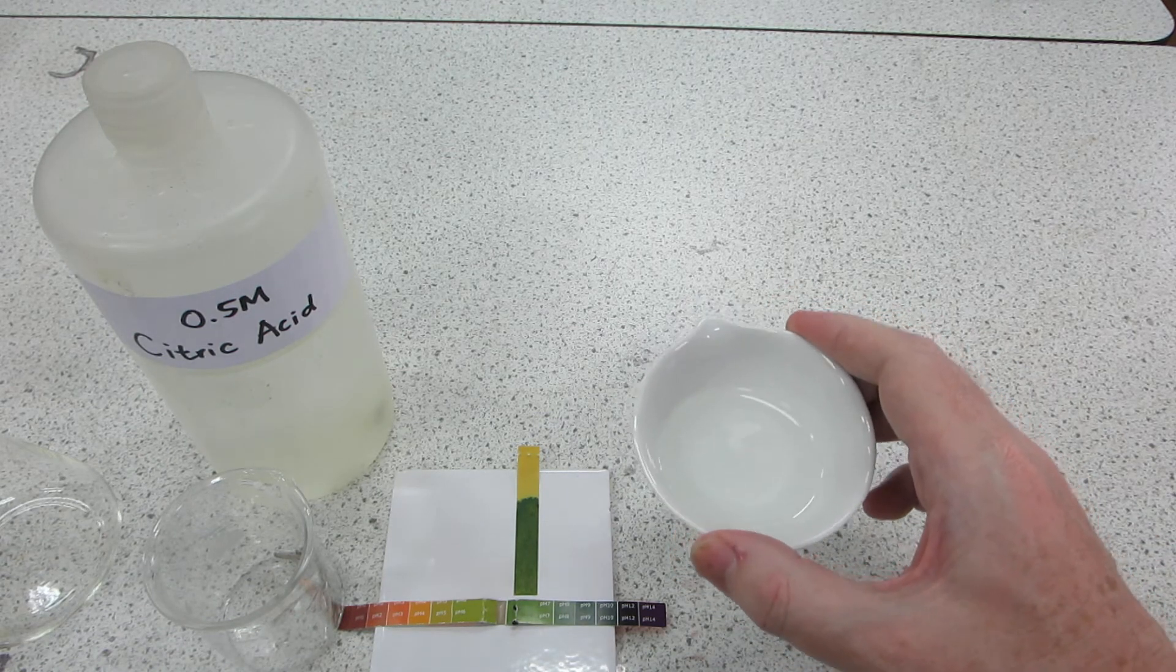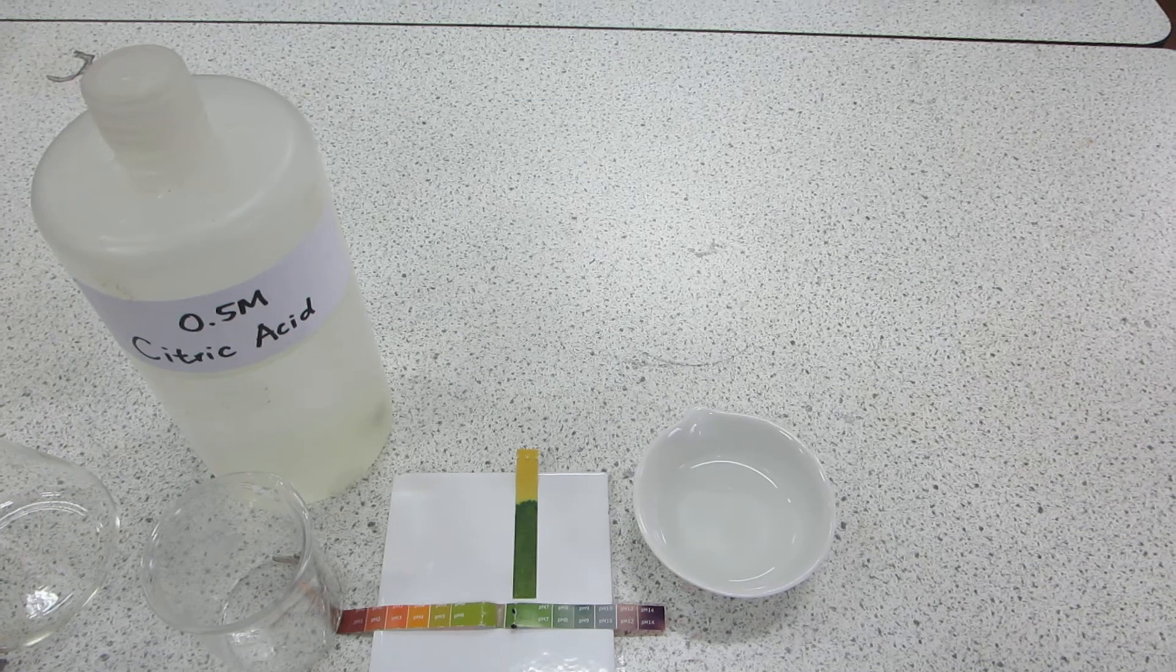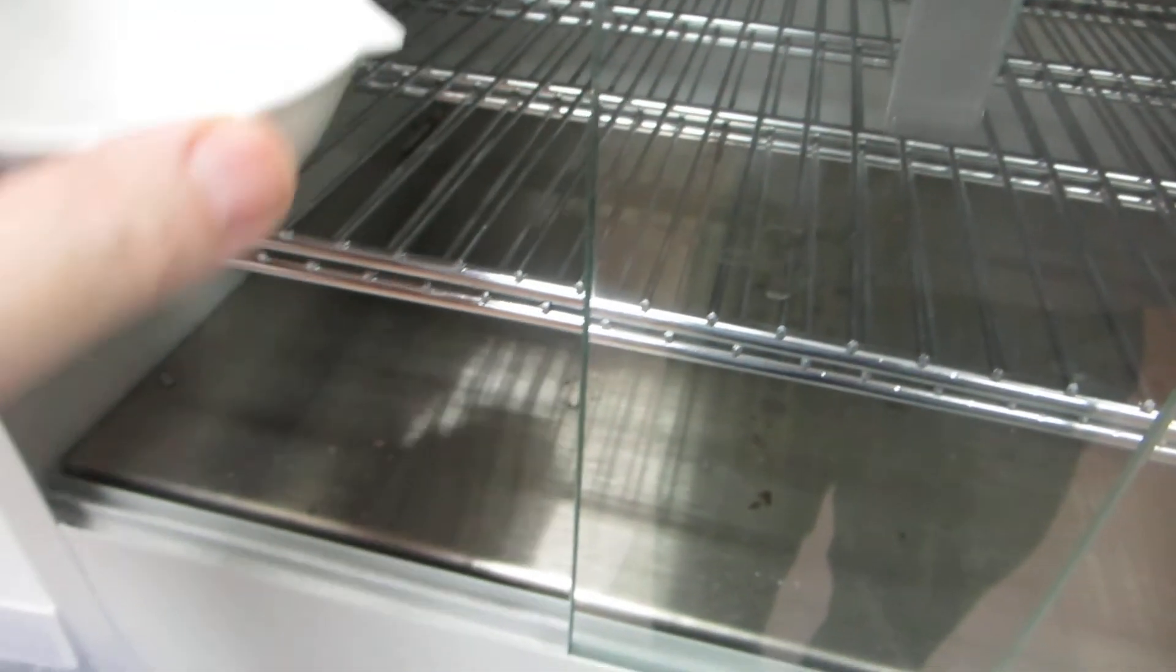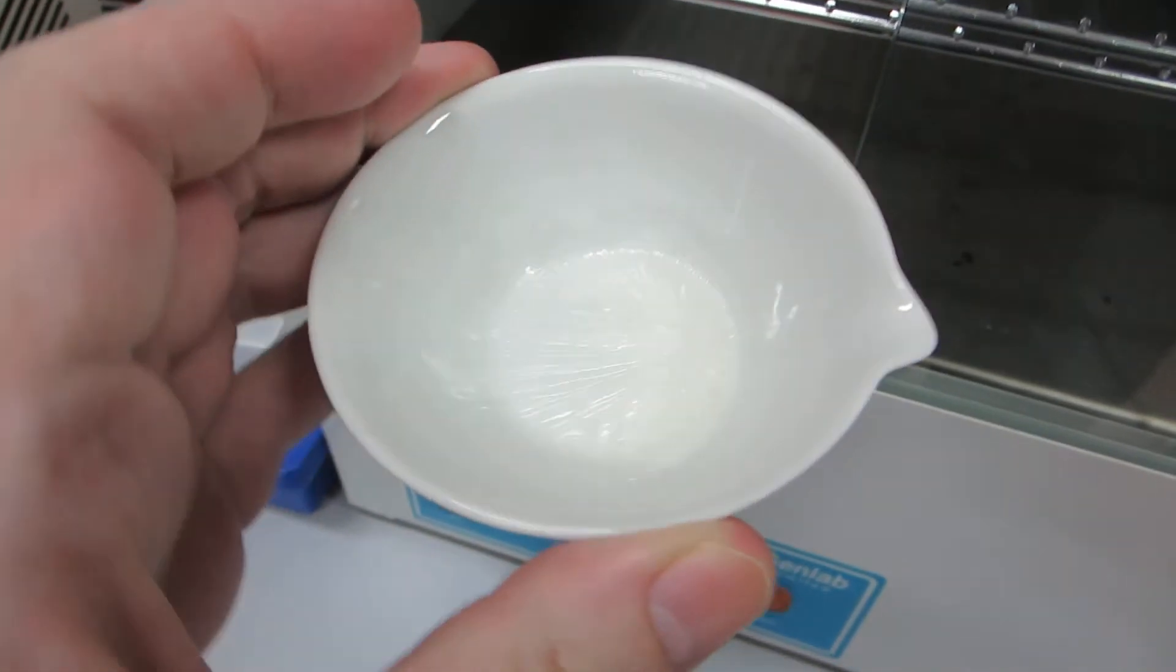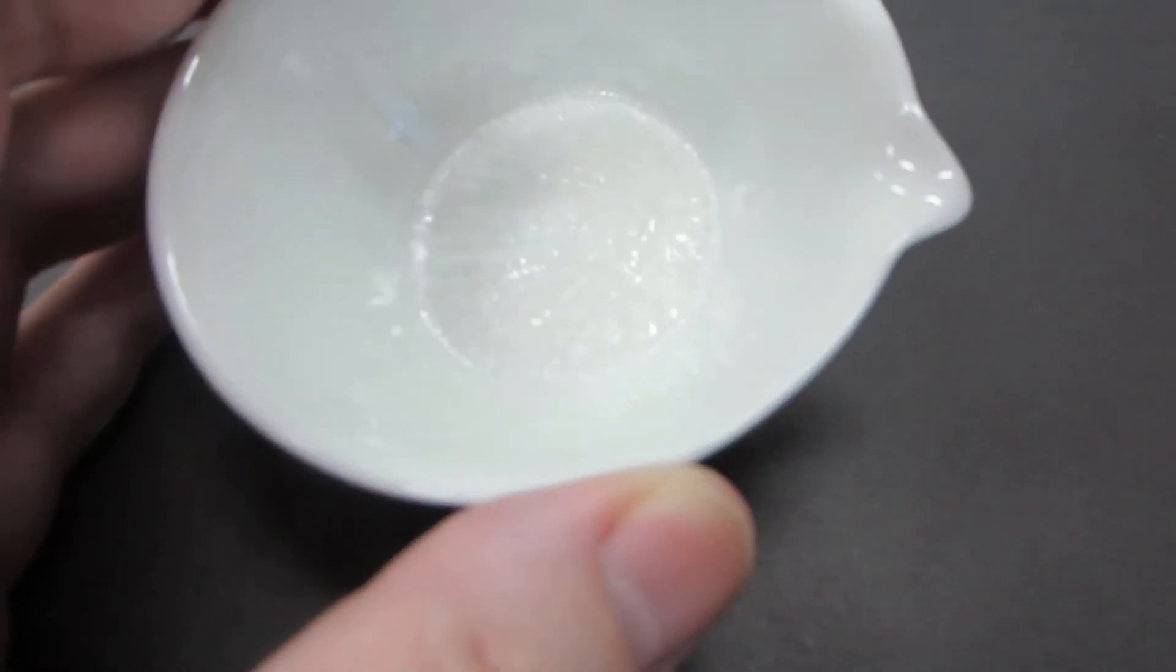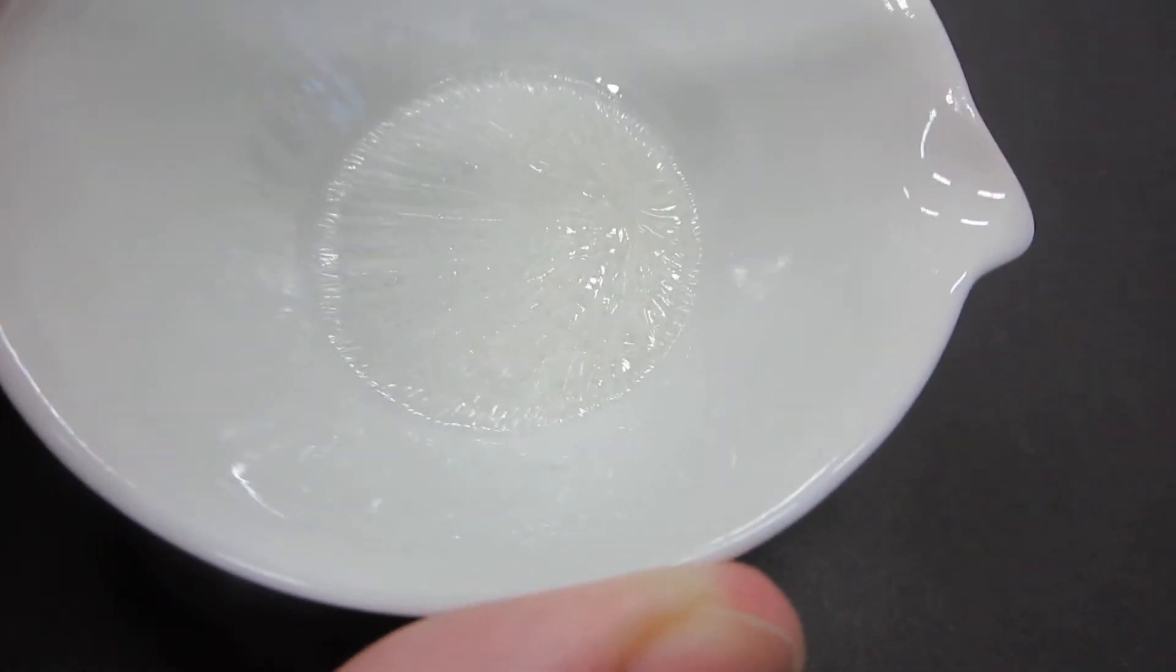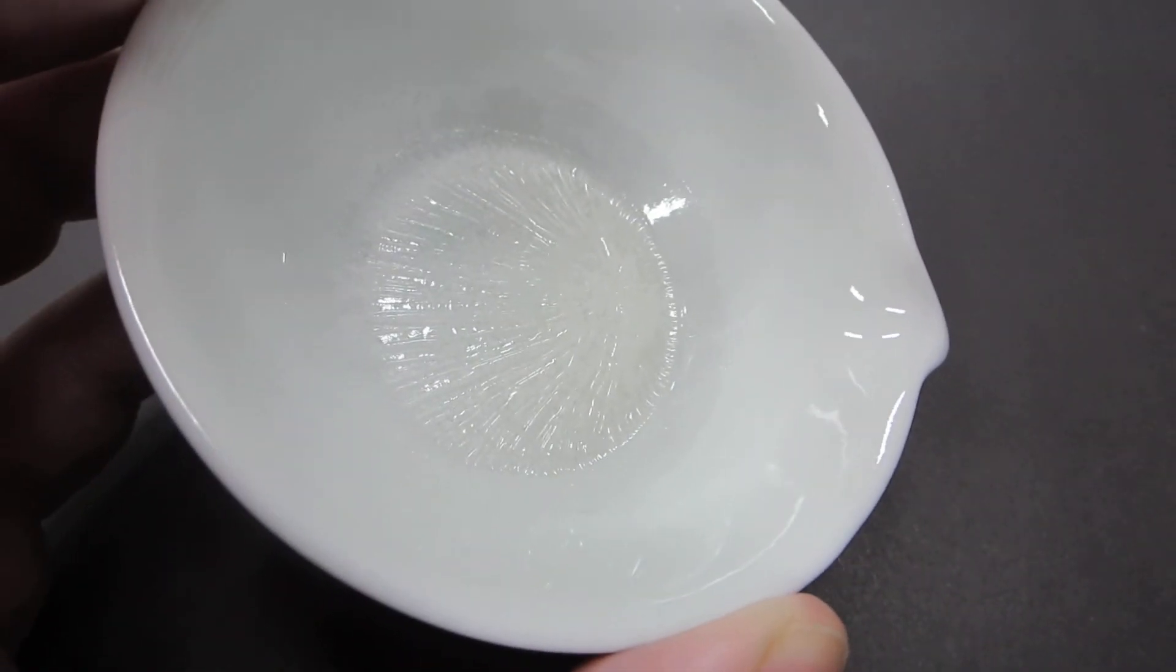And there's the product from the magnesium and citric acid reaction. You can probably see a crystalline surface. What lies underneath that I'm not sure. That's the product.